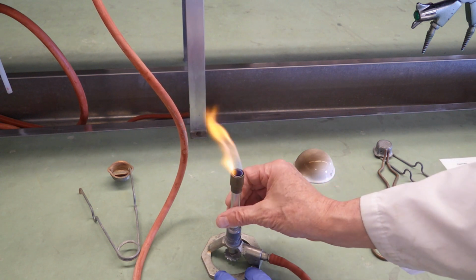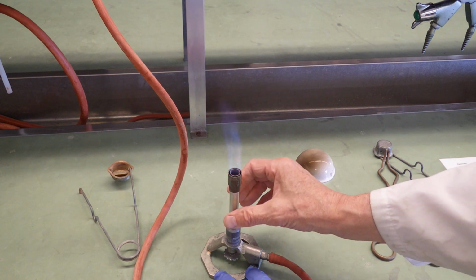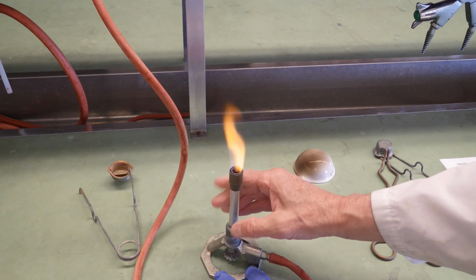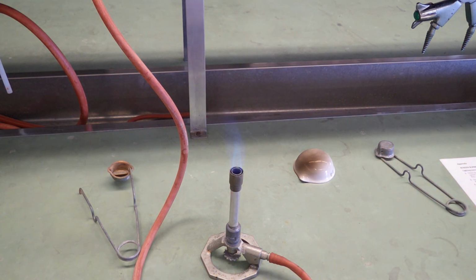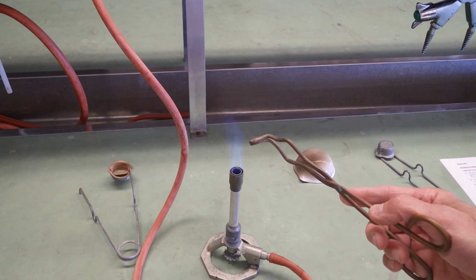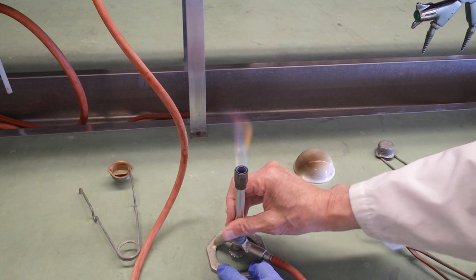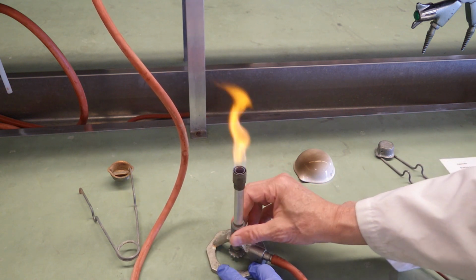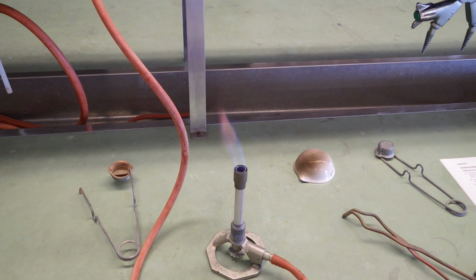If you want it hotter, then you want to raise the barrel and allow more air to come in, and it burns more completely still. Flame gets noisy, and you see an inner blue cone, and the tip of the inner blue cone, where I'm pointing with the crucible tongs, that's the hottest part of the flame. If you want it cooler, simply lower the barrel, rightsy-tightsy, and you have a cool flame, but not luminous. And that's it.